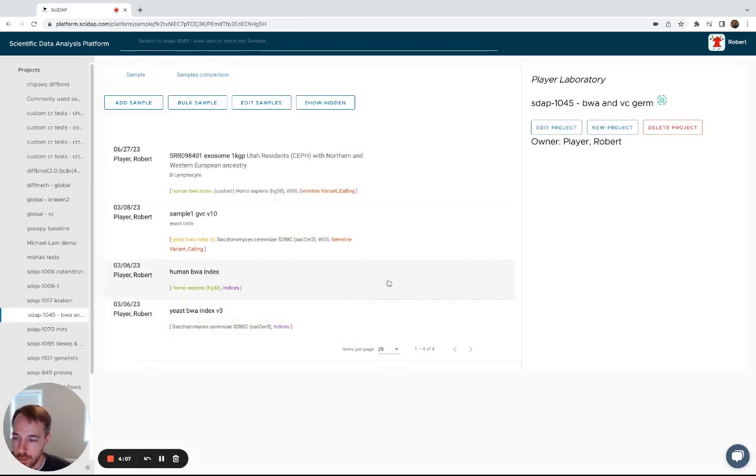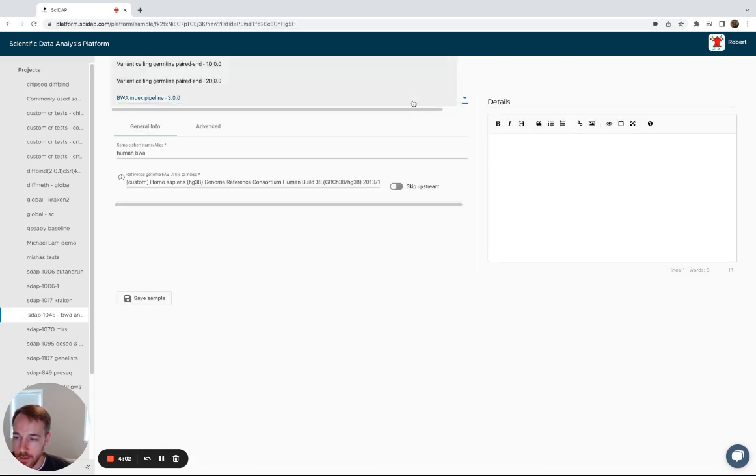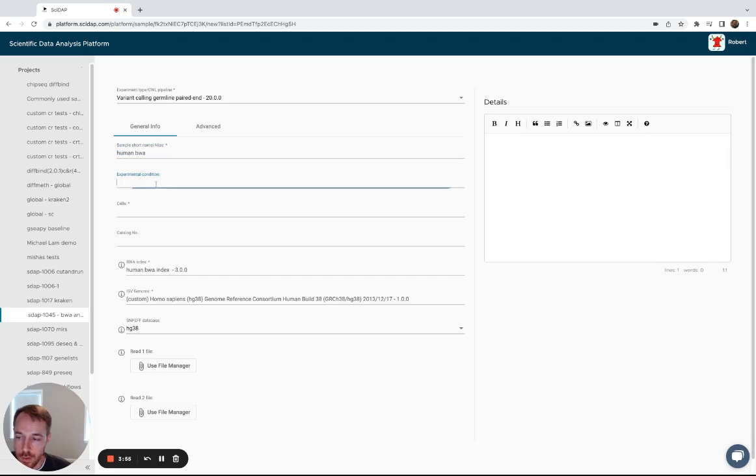Once that's finished building, you'll go back to add sample, select the latest germline variant calling workflow, again name the sample.